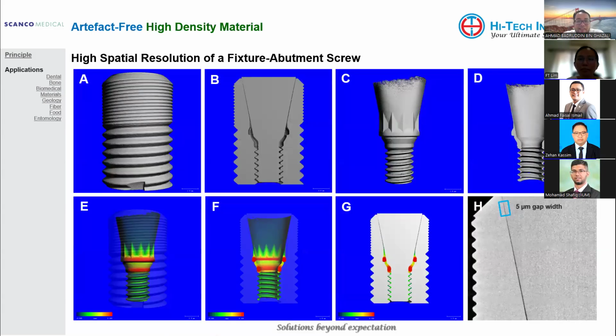We can see clearly the groove of the screws, even the screws inside. That is very amazing, because we definitely cannot see it from our imaging modality here, mainly because of the way they write the algorithm, they try to remove all this artifact.